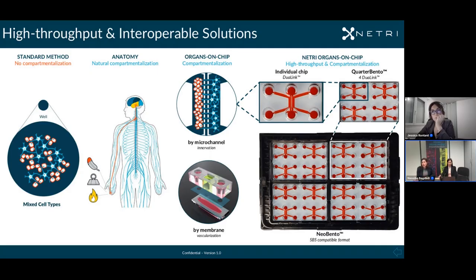In this way, you can recreate the natural compartmentalization where cell bodies or somas are not in direct contact with, for example, if you want a skin model, the keratinocytes, or, for example, pulmonary cells. The only ones that will be in contact with your target cell will be the nervous extremities. So this is our most standard and classic device for 2D cultures.